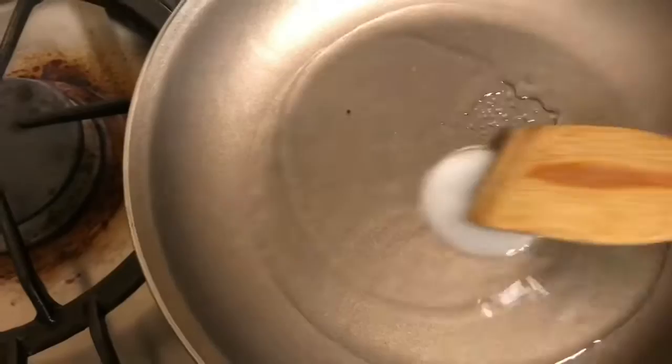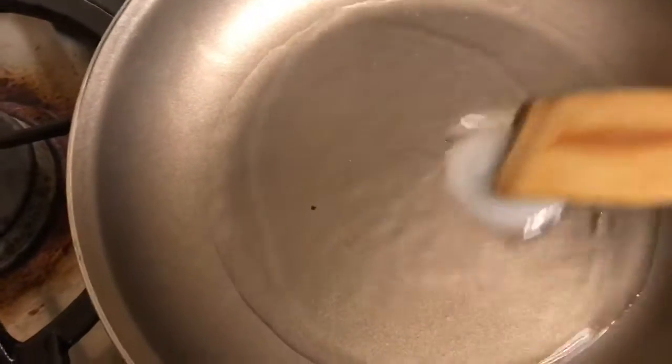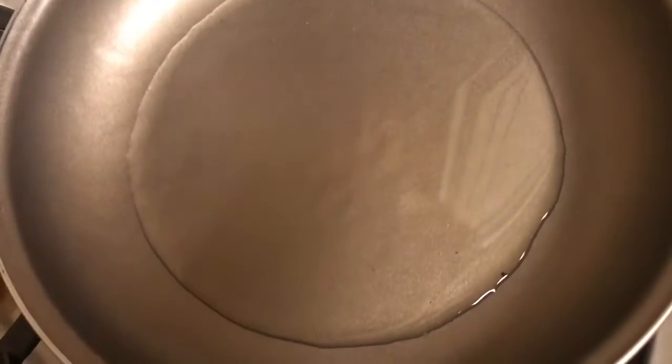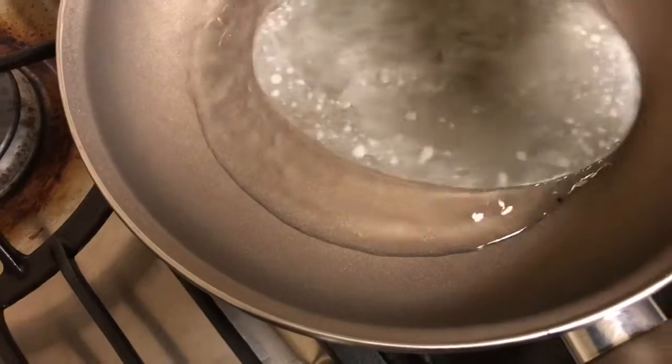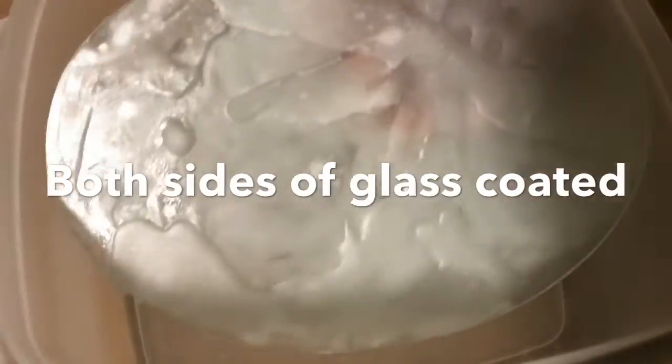Today I'm going to demo etching glass with hydrofluoric acid. First, let's melt some wax to coat our glass. Here it is melted. Let's coat the glass. Here it is with both sides of it coated.